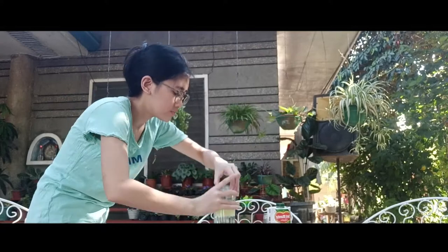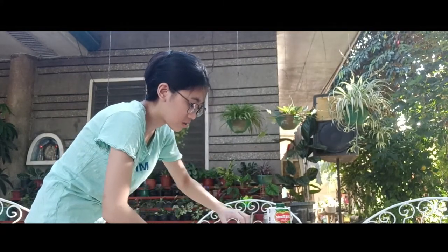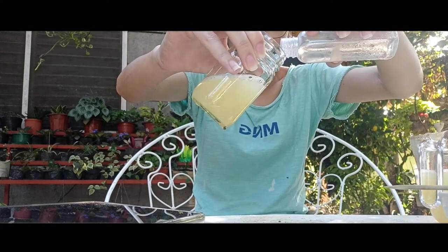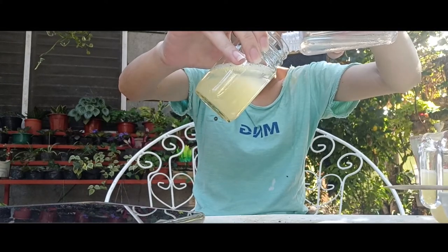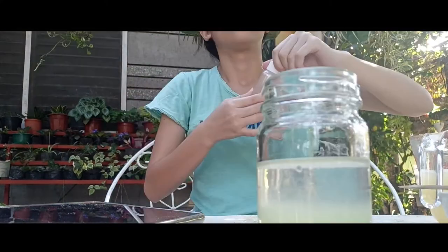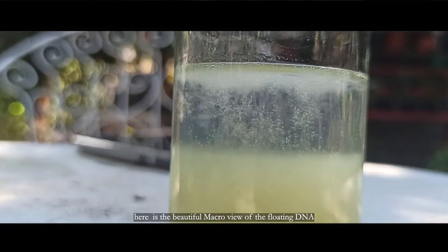Incubate the container by submerging it in 60-degree Celsius warm water. Then tilt the container and slowly add chilled ethanol until you have the same amount of alcohol in the tube as the mixture. Since DNA is soluble in water but insoluble in the presence of salt and alcohol, it is expected to float upon the addition of alcohol.